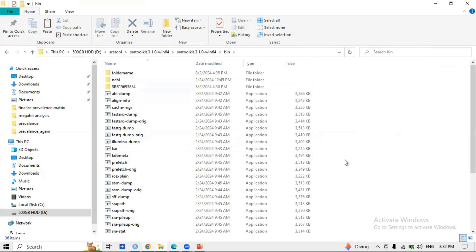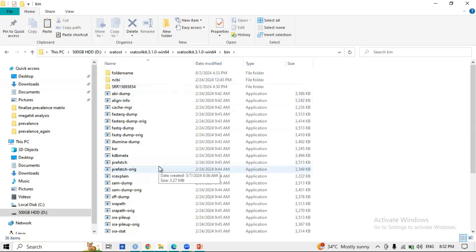When you are downloading the file, the FASTQ files will automatically download into your bin folder. If the SRA Toolkit is present in the D drive, files will download to D; if it is in the C drive, they will download to C. I recommend using the D drive for downloading because it has more storage space.